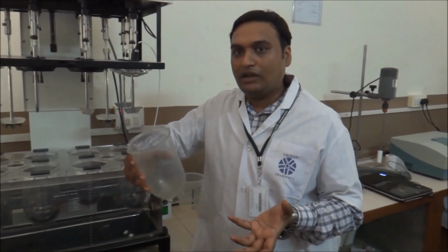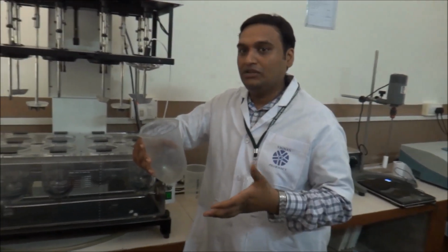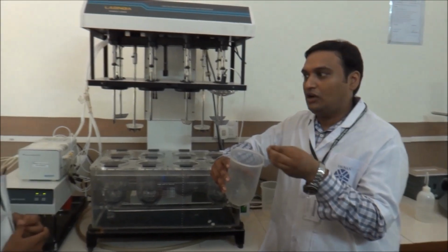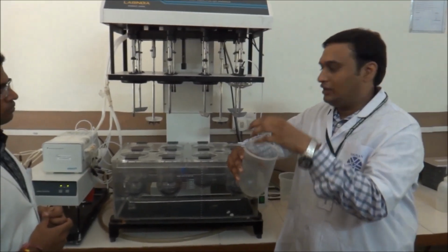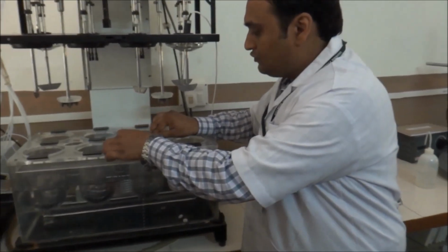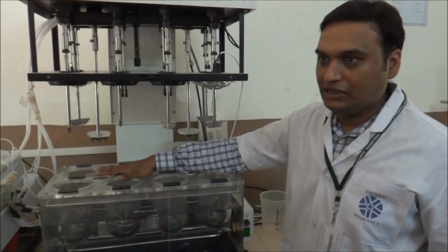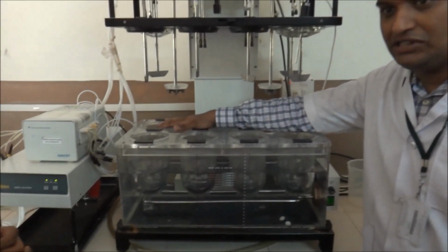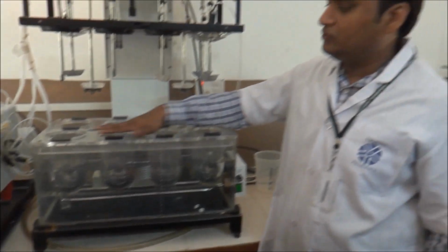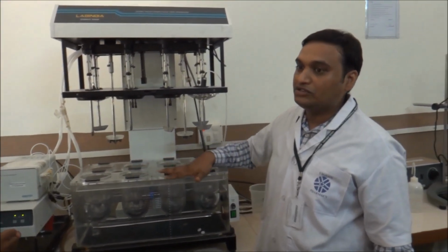Now as we all know, for dissolution to occur, we need a surrounding solvent system. So for that, we are going to select a suitable solvent in which we are going to put the tablet dosage form. Although there are 8 beakers here, each having 1 liter capacity, some instruments are named Disso 8000, indicating 8000 ml.